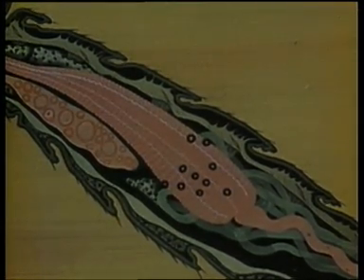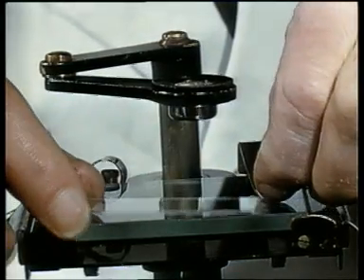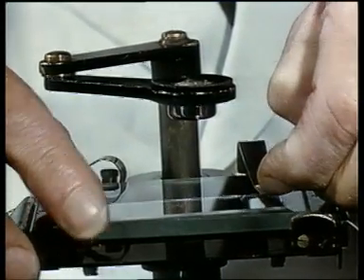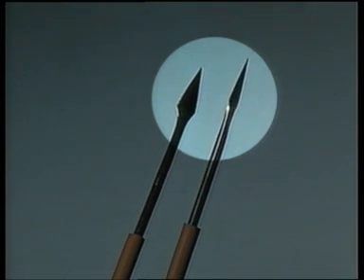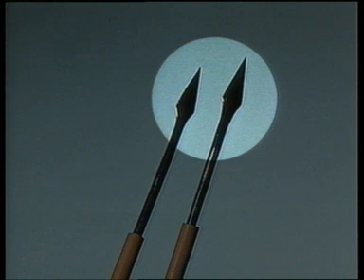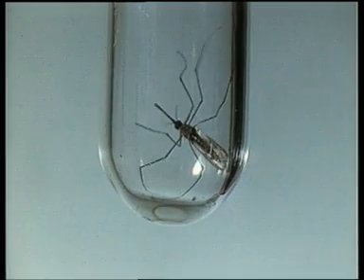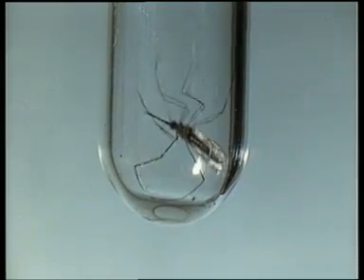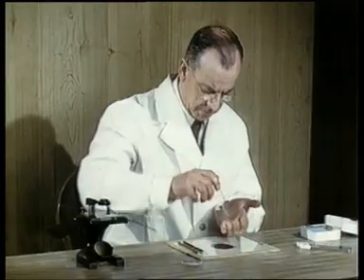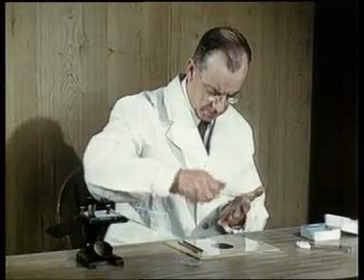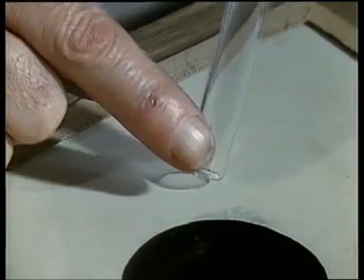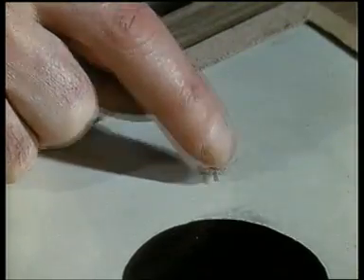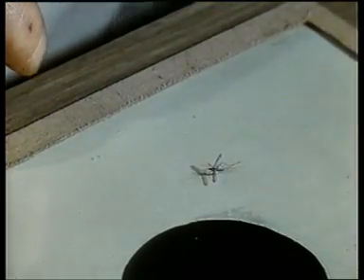Dissecting a mosquito is a quick and simple matter after a little practice. In addition to the dissecting microscope, the only instruments needed are two very sharp stainless steel dissecting needles — stainless steel because the dissection is carried out in saline, which is corrosive to ordinary steel. The mosquito is placed in a narrow test tube, shaken to the bottom of the tube, and then stunned by tapping the tube sharply on the hand. The insect is killed by pressing it lightly on the thorax, not too hard, or it'll be crushed.